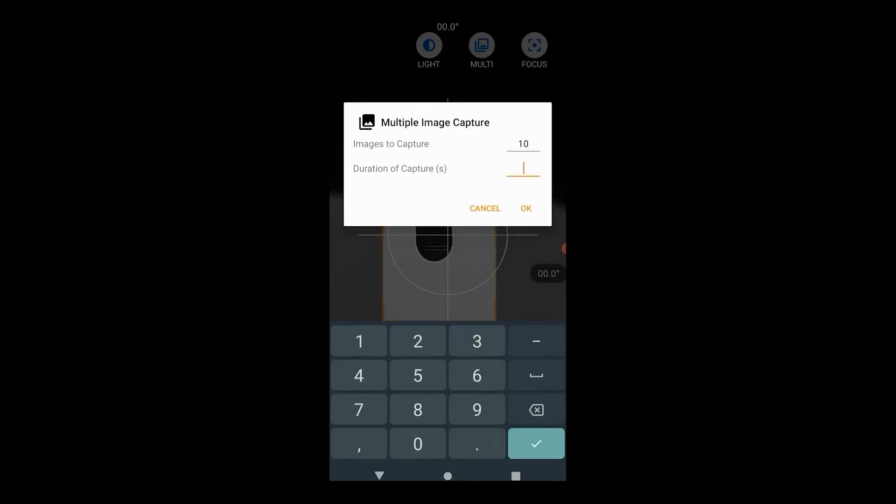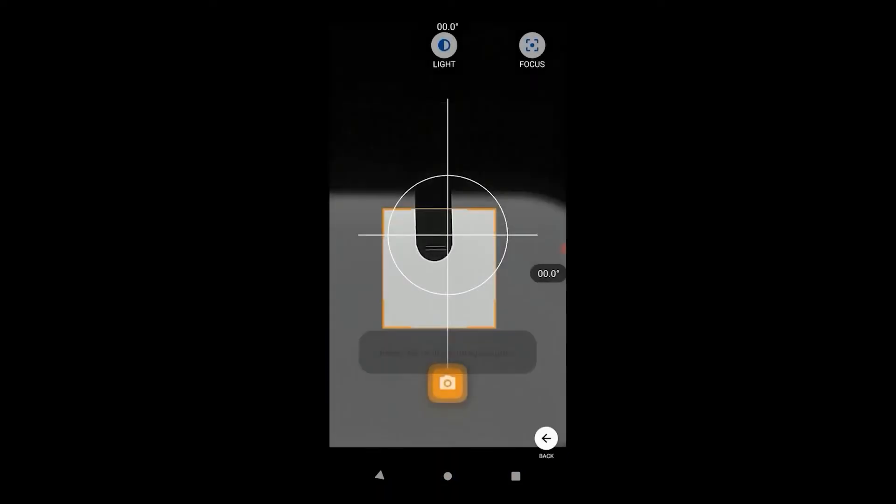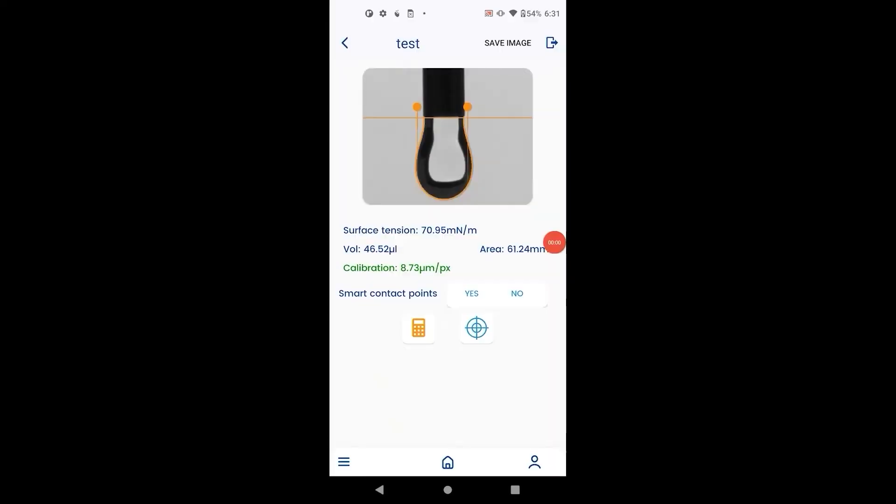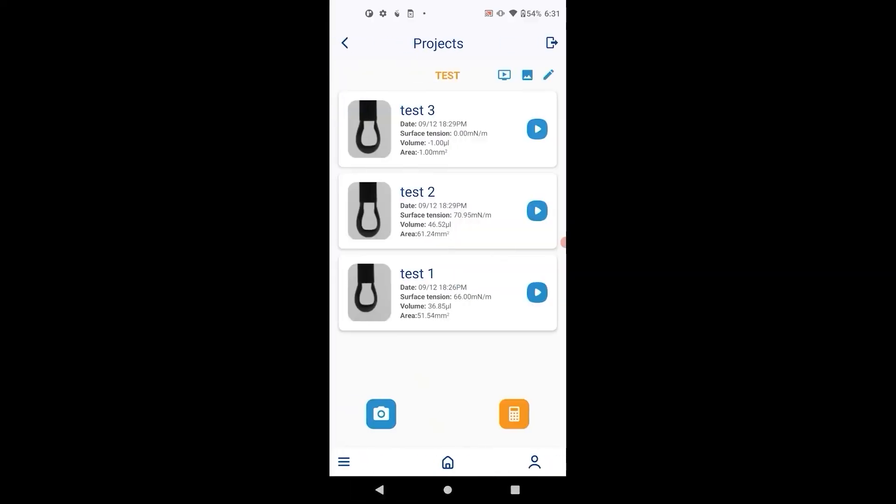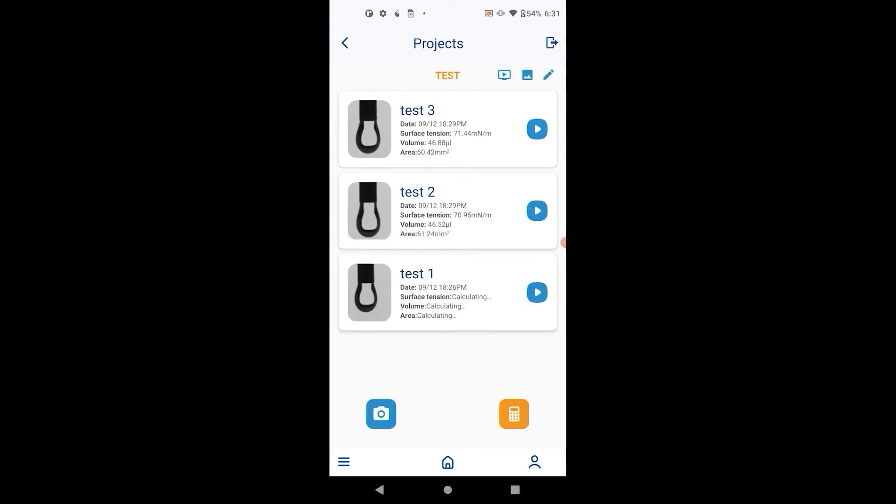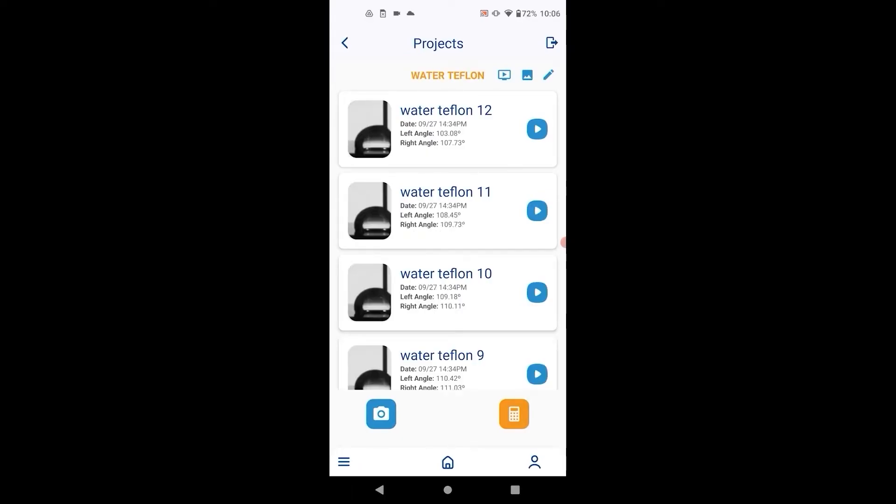Simply specify the number of images to capture and the duration of capture. Once you are ready hit the capture button and start generating the droplet. Go to one of the images, do the entire calculation process including calibration. Then go back and hit calculate all to process all the images captured in this time frame.